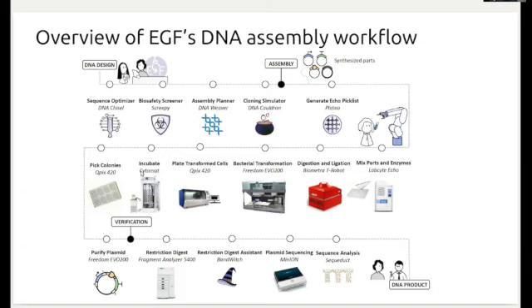We have, again, our own software that can take the data, a zip file basically, from the fragment analyzer, take the reference files, and tell you what samples are good, what clones are good, and what are not. More recently, we have acquired a MinION sequencer and set it up in the lab to work in an automated, semi-automated manner, and developed the corresponding pipeline that we are going to publish very soon that can, in a one-step way, analyze the data and provide a nice report on each of the barcode sequenced plasmids that we have made, for an extra cost.